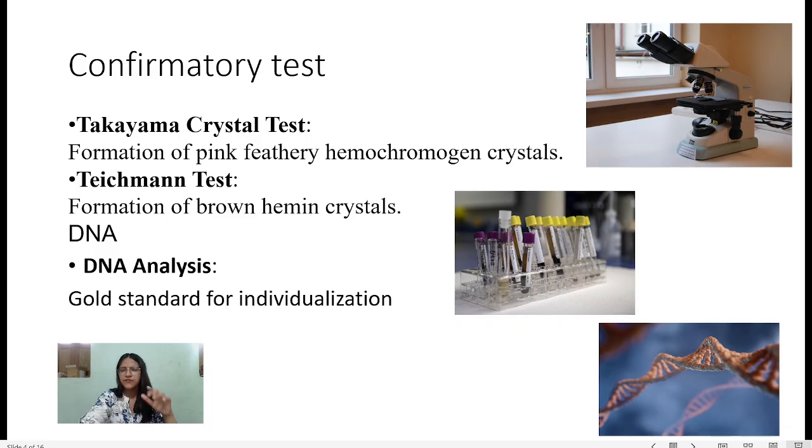The significance of this test is that it is the most powerful tool in forensic science. It can be used for individual identification, as I have told you, or even paternity tests can be done by this test. It is also used for criminal casework.